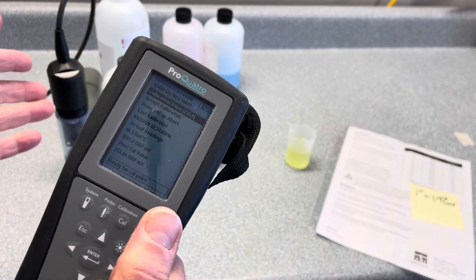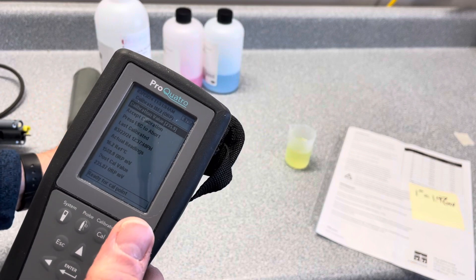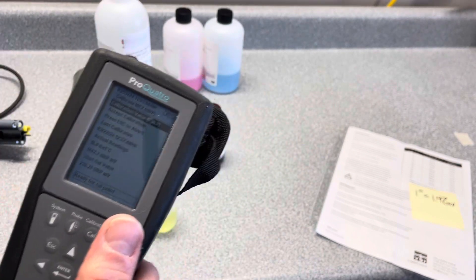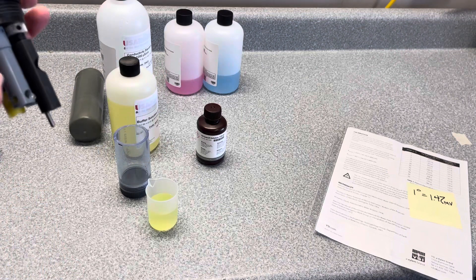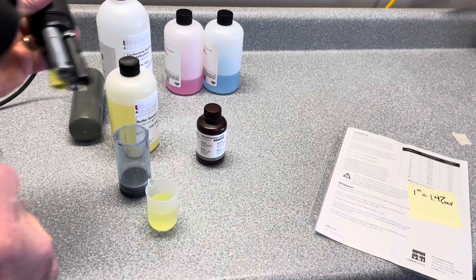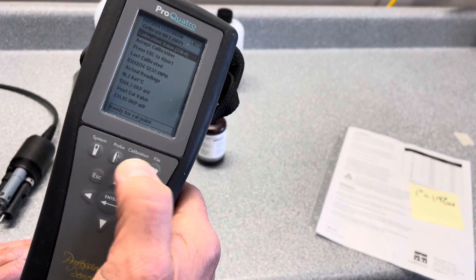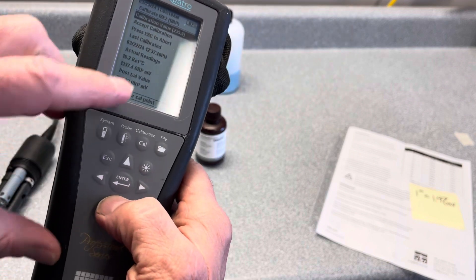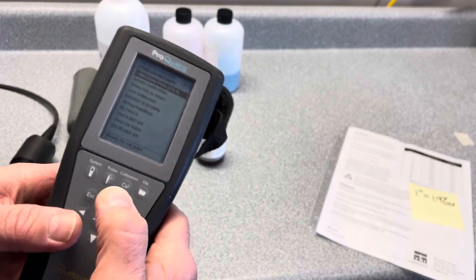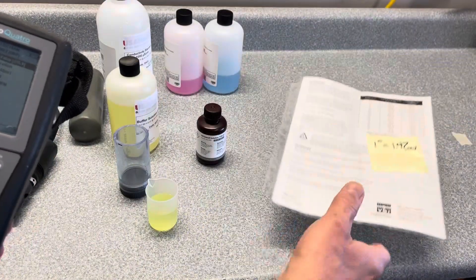We would do the same procedure: make sure we have a clean calibration container, set the probe in making sure the solution is about halfway up, and let it equilibrate. Then toggle down to accept calibration, just making sure that you have a good calibration value that matches your sheet.